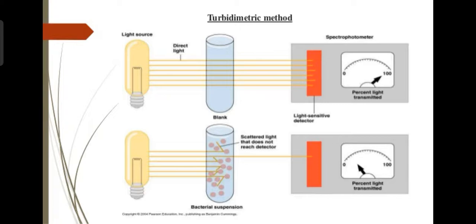So this is about the turbidometric method. This is a brief explanation of all types of counting methods.